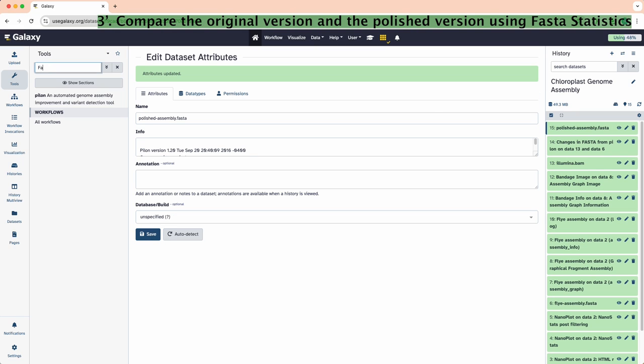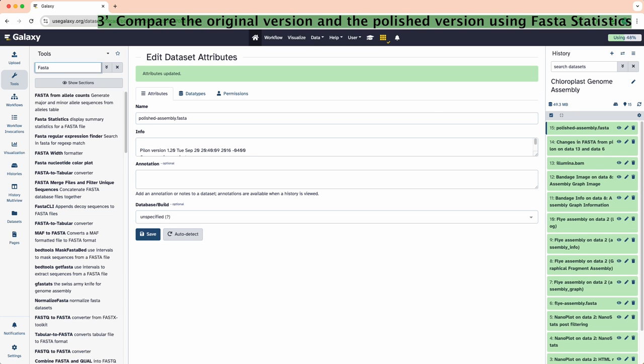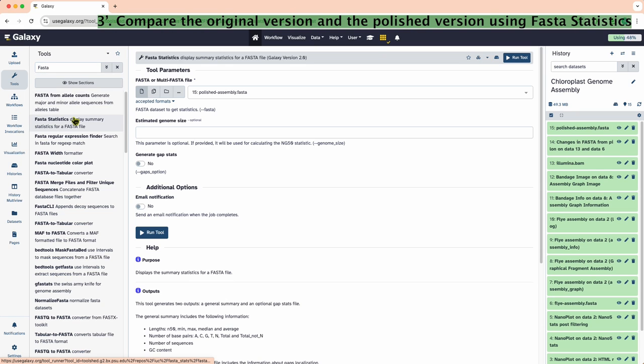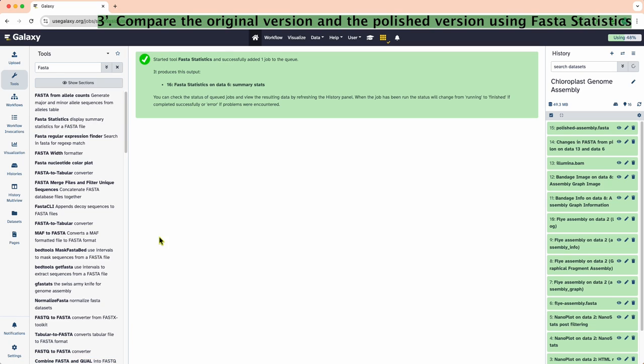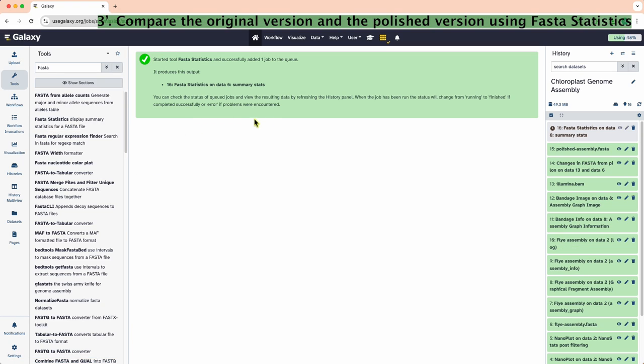To compare the results, run fasta statistics on both the original Flye assembly fasta and the new polished assembly fasta.